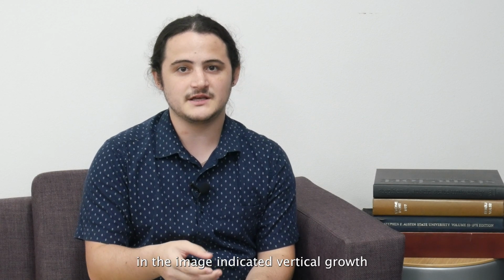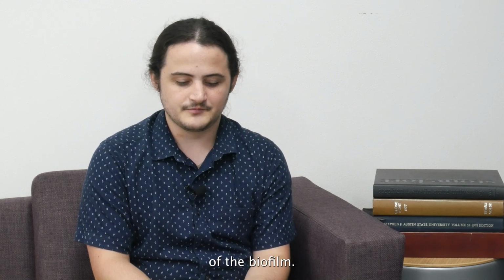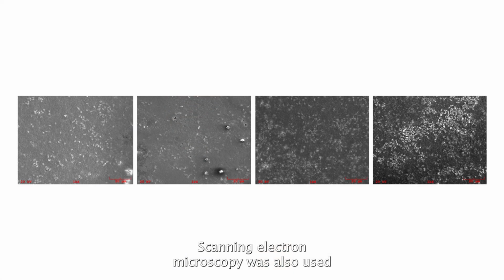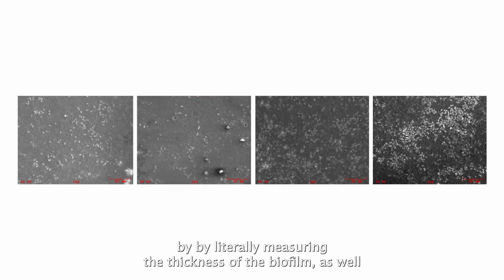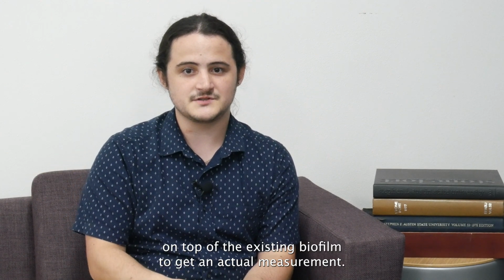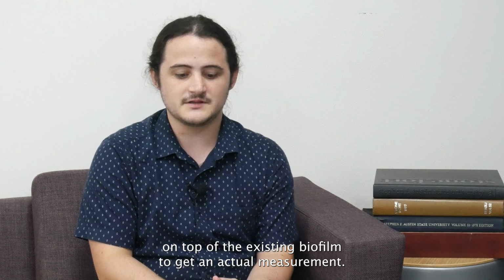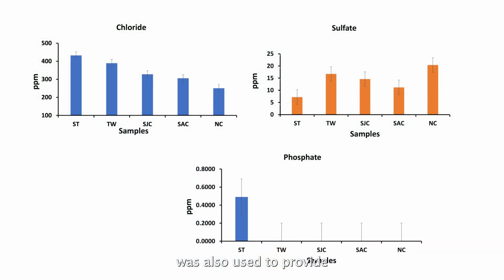We found that lighter spots in the image indicated vertical growth of the biofilm. Scanning electron microscopy was also used in order to quantify the amount of biofilm growth by literally measuring the thickness of the biofilm, as well as measuring the height of various aggregations on top of the existing biofilm to get an actual measurement. Ion chromatography was also used to provide the chemical properties of the biofilm.